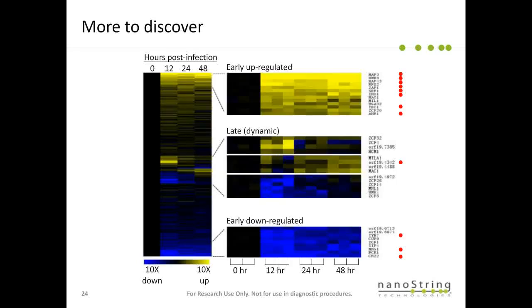So, as you know, we pulled out a lot more transcription factors with the same expression pattern. Obviously, we can study those transcription factors to see whether they indeed also play a critical role for infection. So again, this data set serves as a nice hypothesis generator.